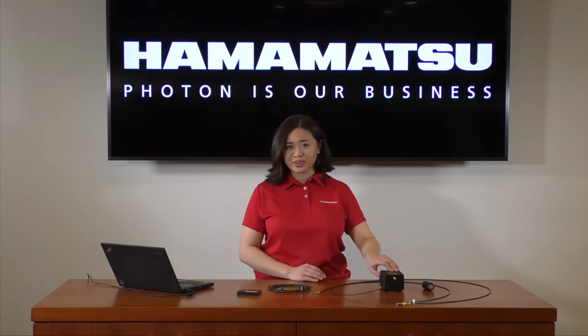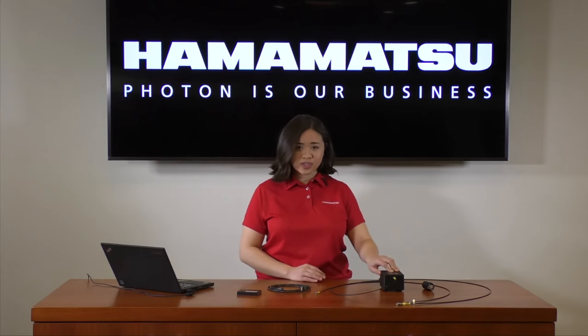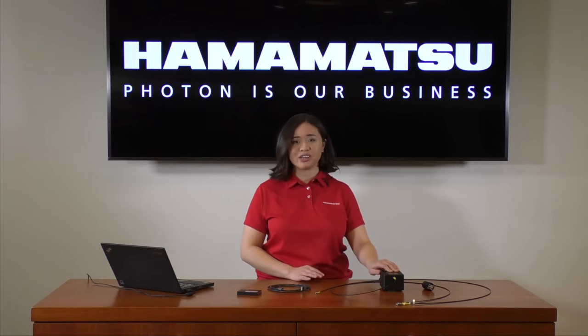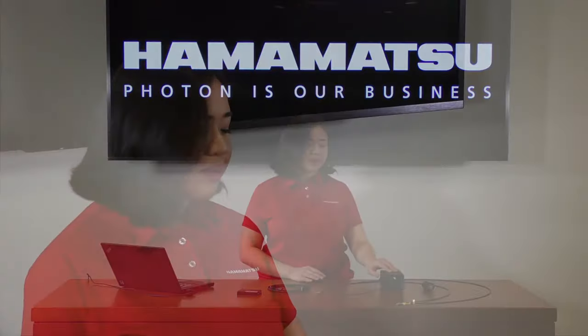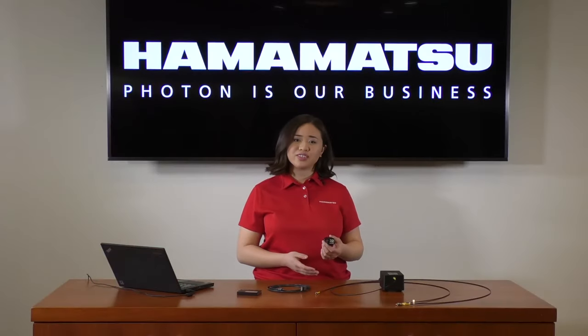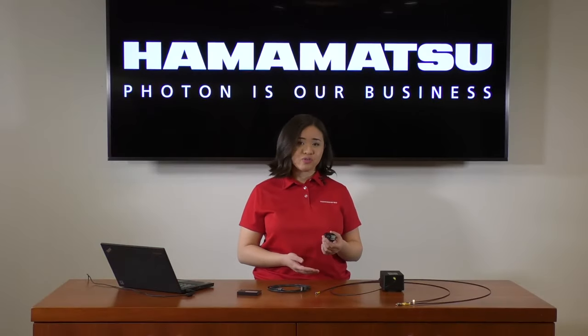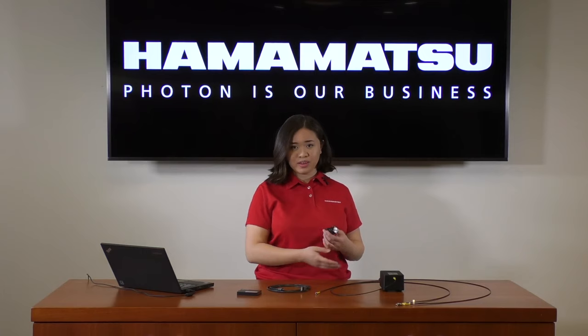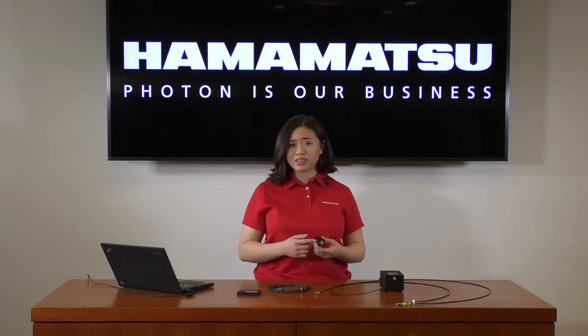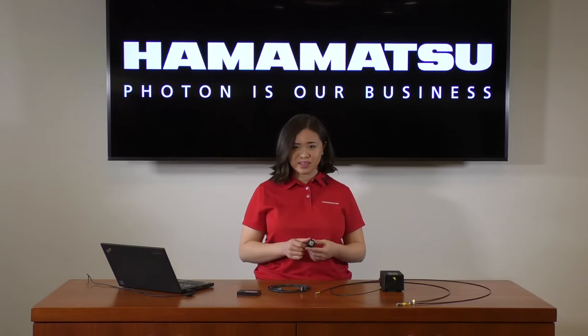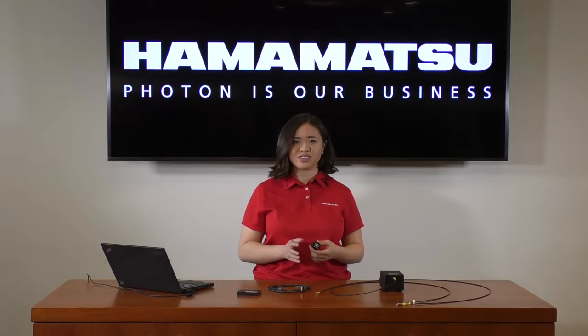in the event that your light source saturates the spectrometer even at the minimum integration time, we recommend using an iris to adjust how much light travels through the fiber to the spectrometer. Unlike adjusting the current or voltage supplied to a lamp, using an iris allows you to affect how much light is seen by the detector without making any changes to color temperature.